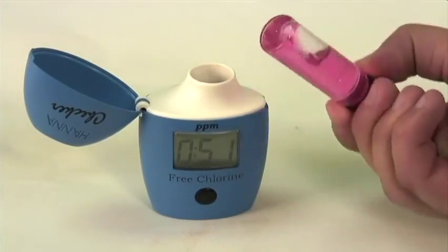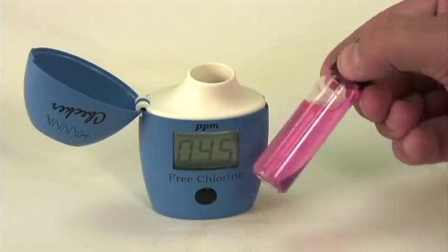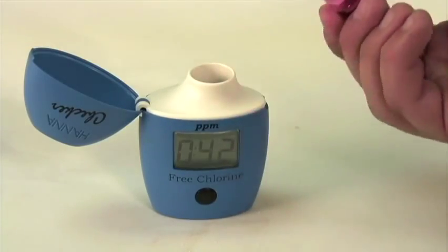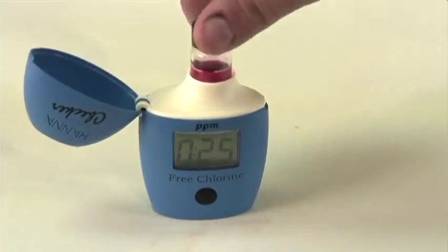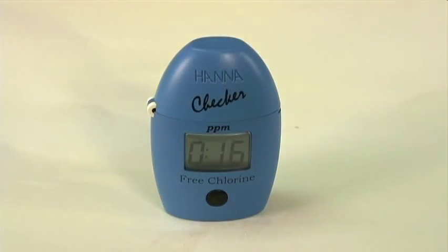You're going to want to mix your sample by inverting the cuvette rather than shaking it, to prevent air bubbles from distorting your measurement value. Again, you're going to wipe the cuvette down, insert it into the meter, and close the lid before the meter hits zero. When the checker hits zero, it automatically begins the process of reading, so you have to make sure that the measurement is in there. Now it's going to take the measurement — you see the three dashed lines — and we get a free chlorine value of 1.93.